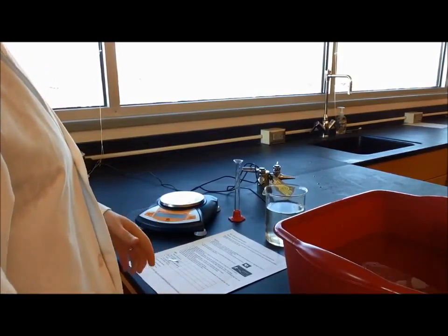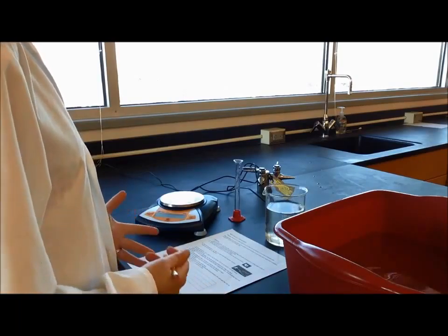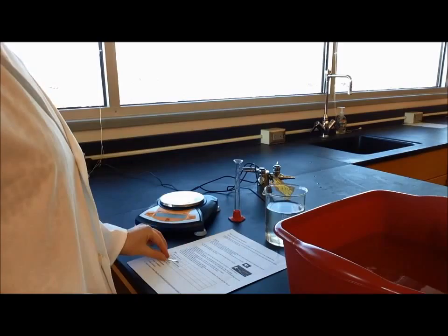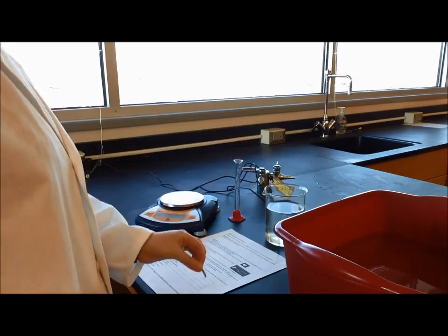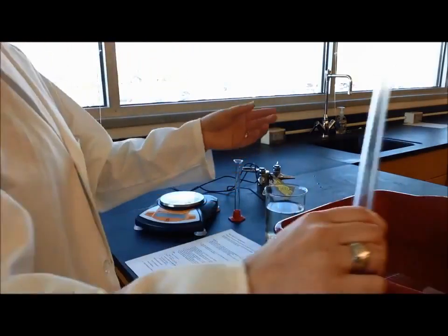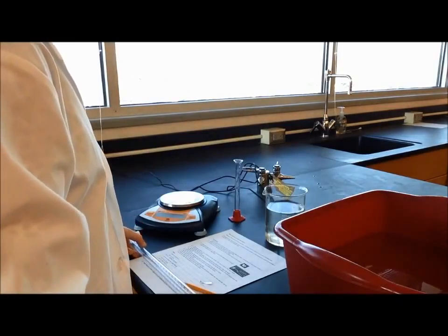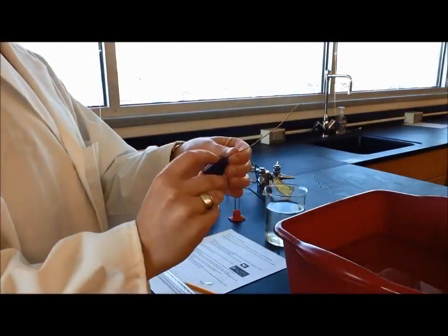This is the molar volume of a gas exploration. Working through the procedure: step one says on your tables you should find a large bucket filled with water, a small piece of magnesium metal, a glass burette — that's this long glass tube — and a rubber stopper with copper wire.